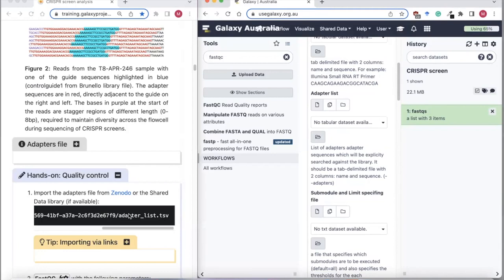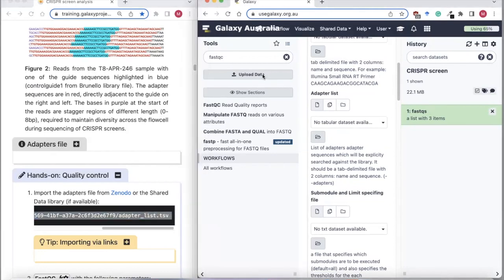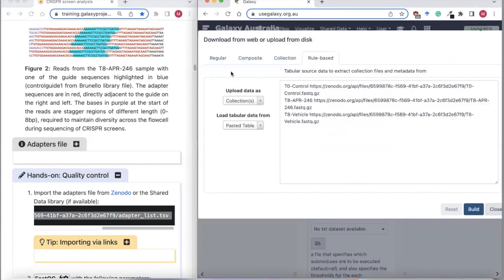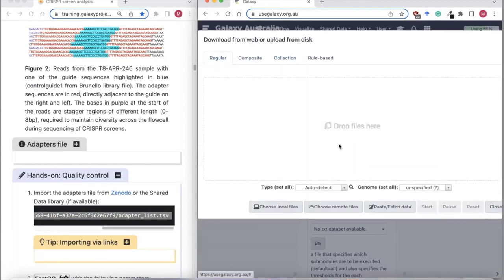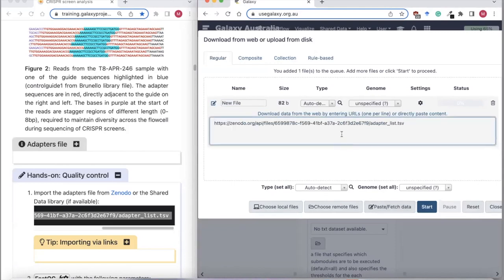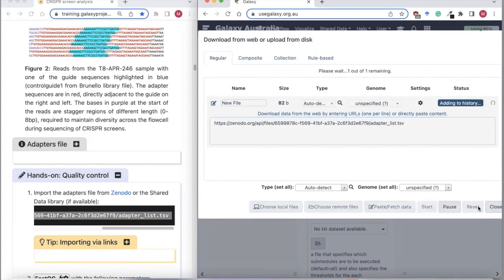We're going to upload this adapters file. I'll copy the link, go to upload data — this time I'm not making a collection since it's a single file. I'll use Paste/Fetch, paste in the link to this adapters file, and click Start.